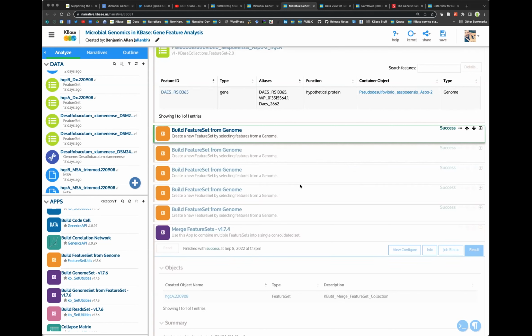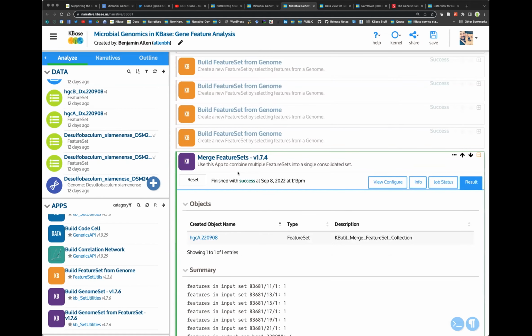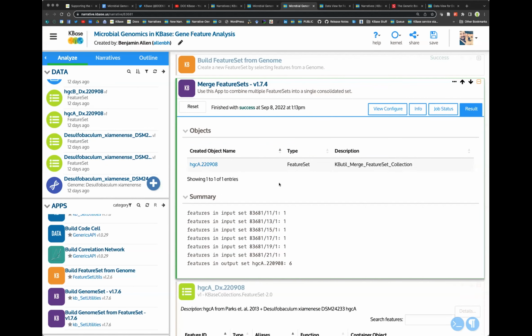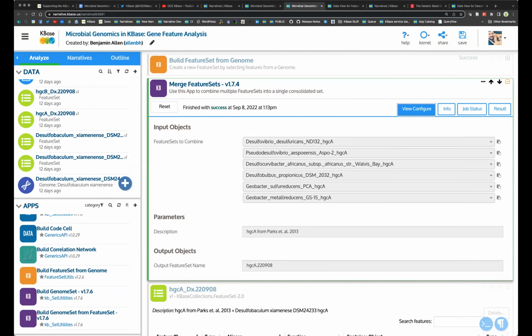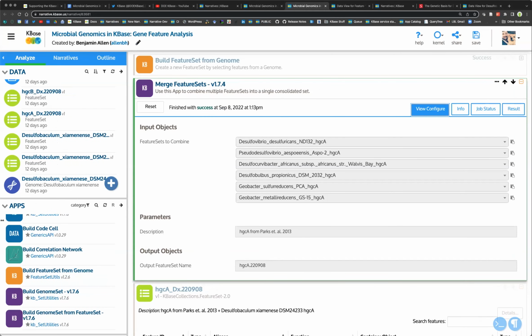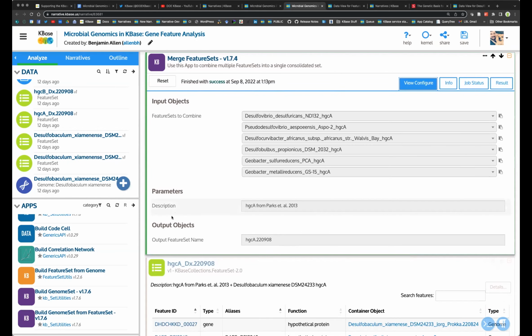Okay, sorry, just looking at the chat here. It looks like most people can see my narrative pretty well. Maybe I'll do a little boost of the resolution there so you can see better. Okay, maximize the window. I'll stretch it out, yes, just a little further here. I don't always do full size because you try to get it as close to the proper resolution for YouTube as possible. But this should work fine. Thanks for letting me know in the chat there.